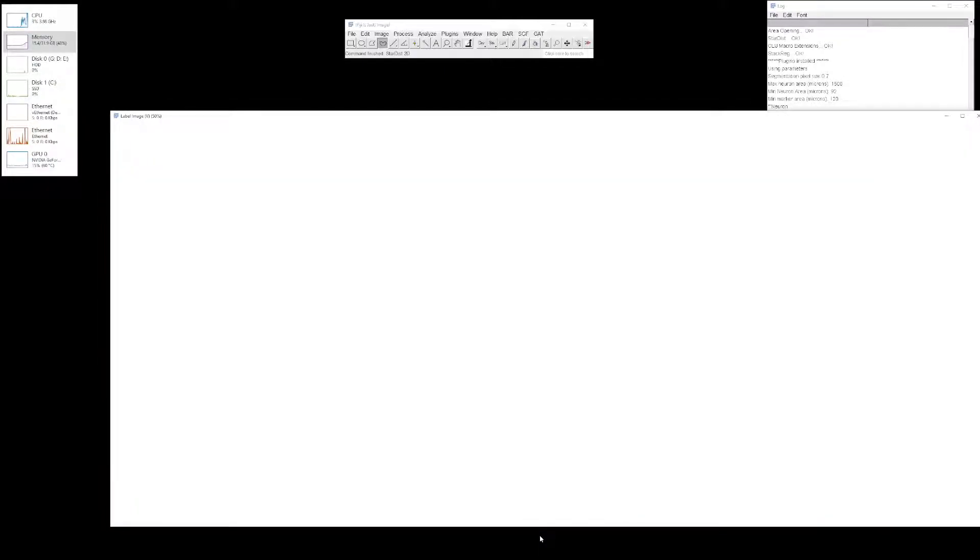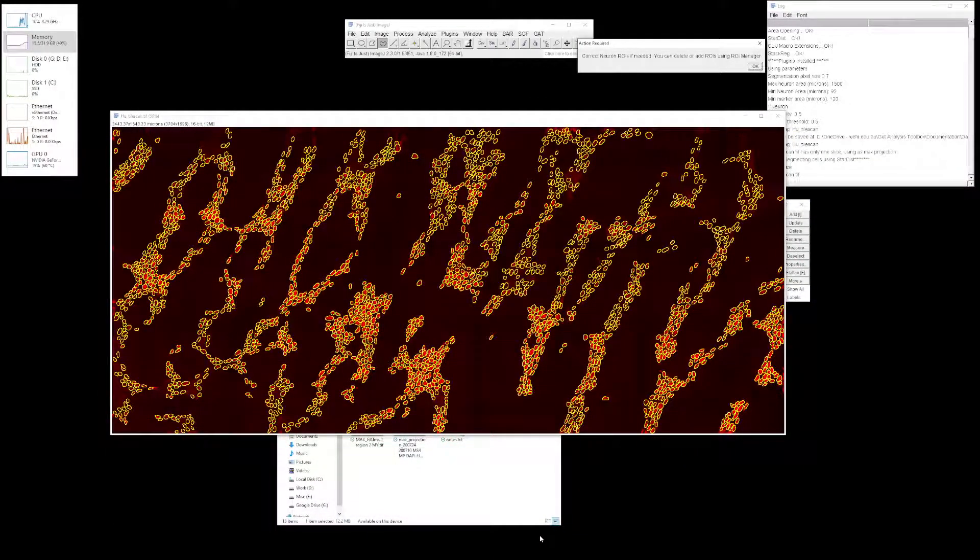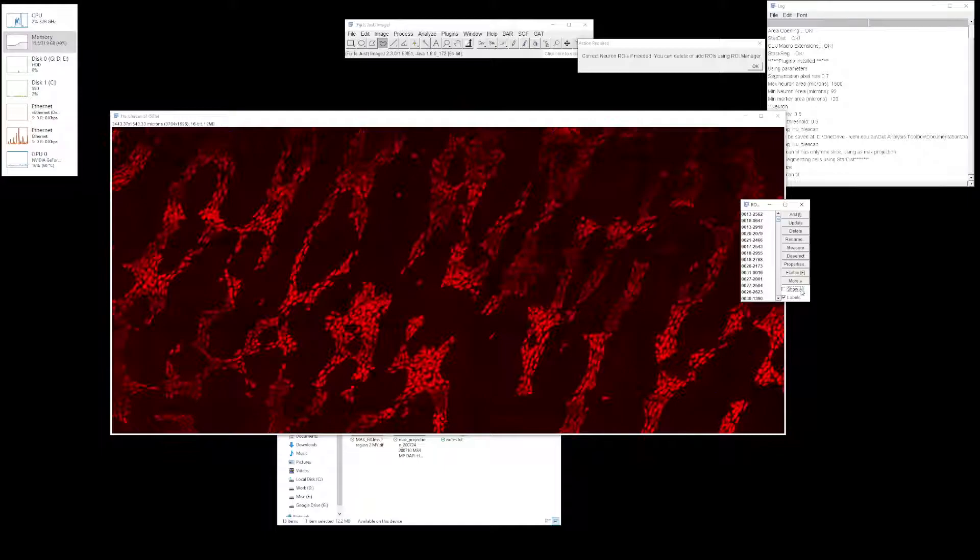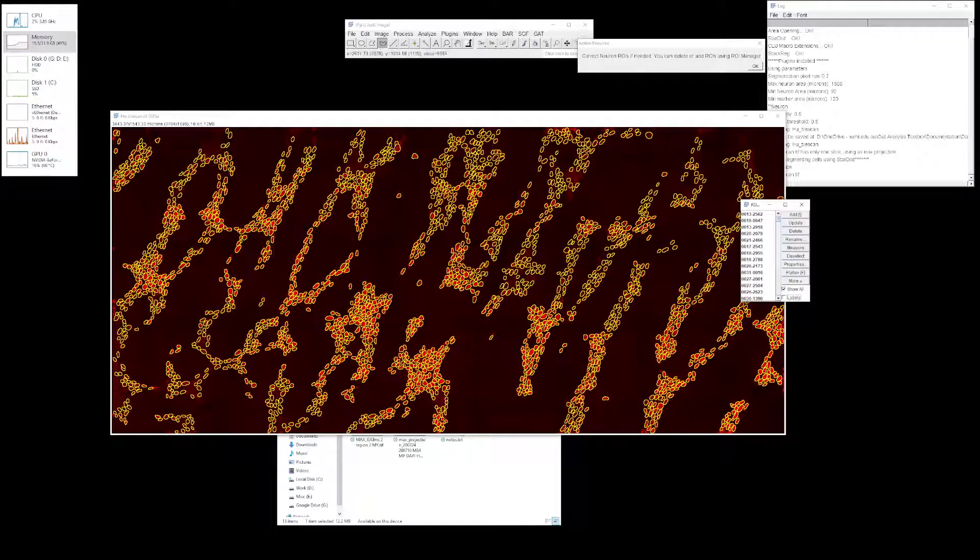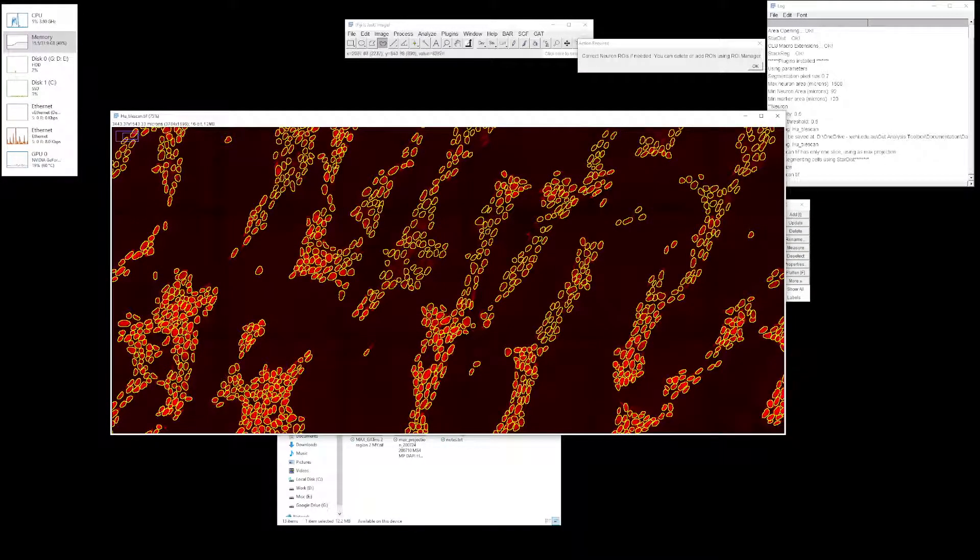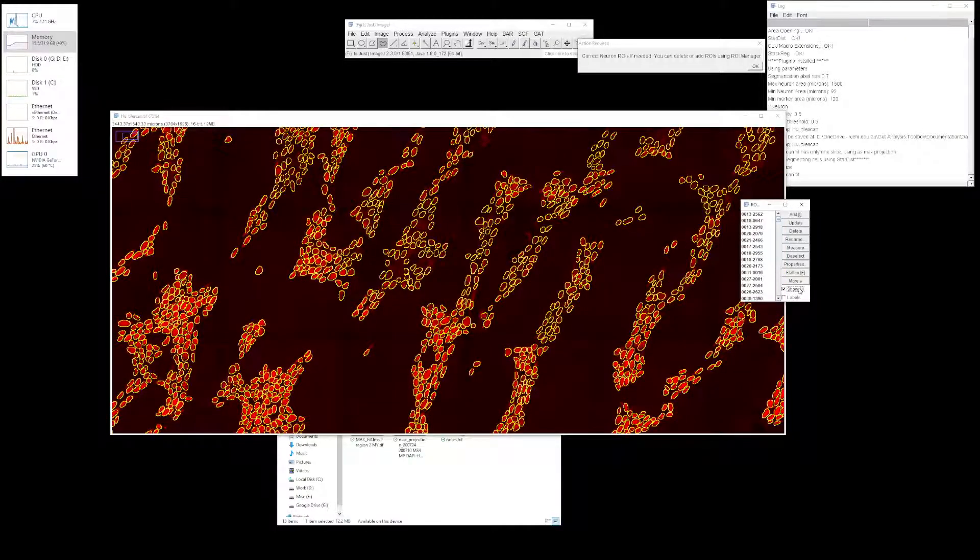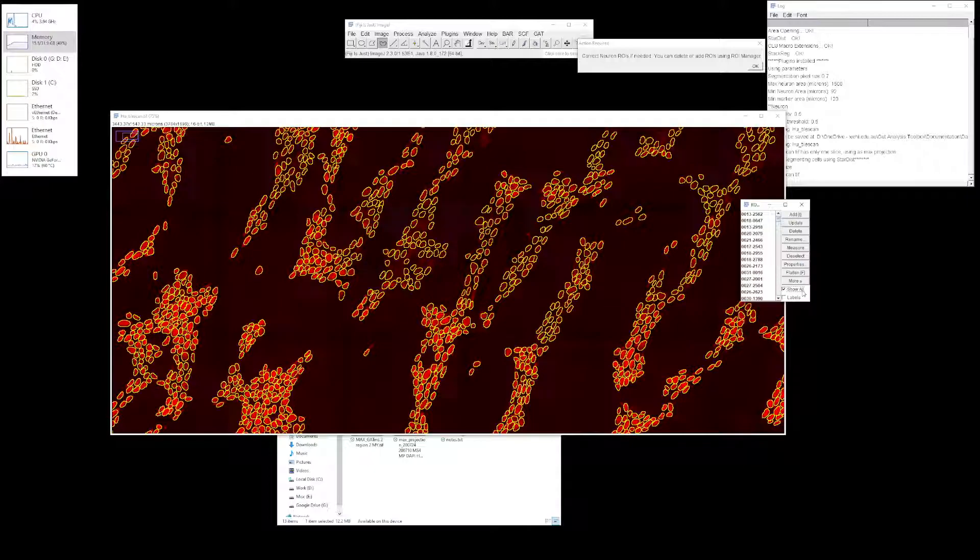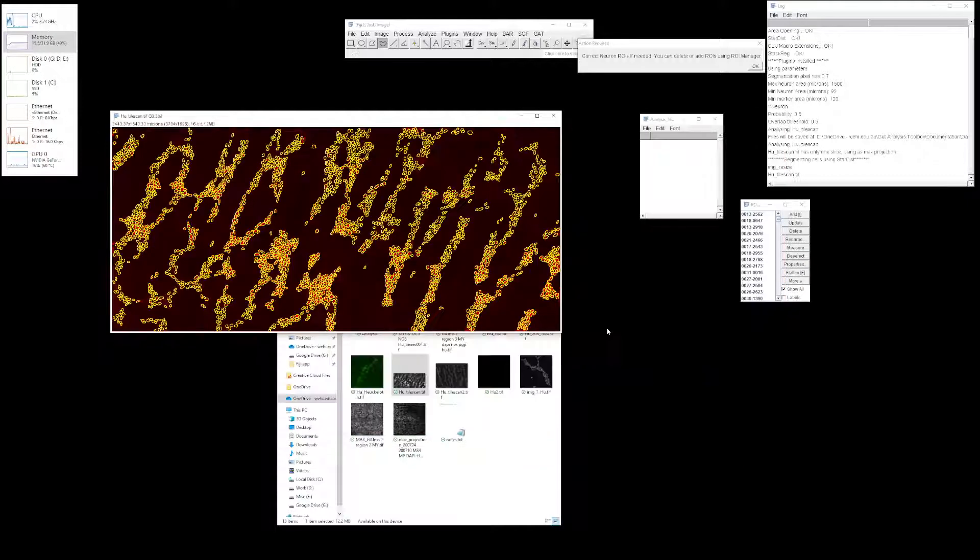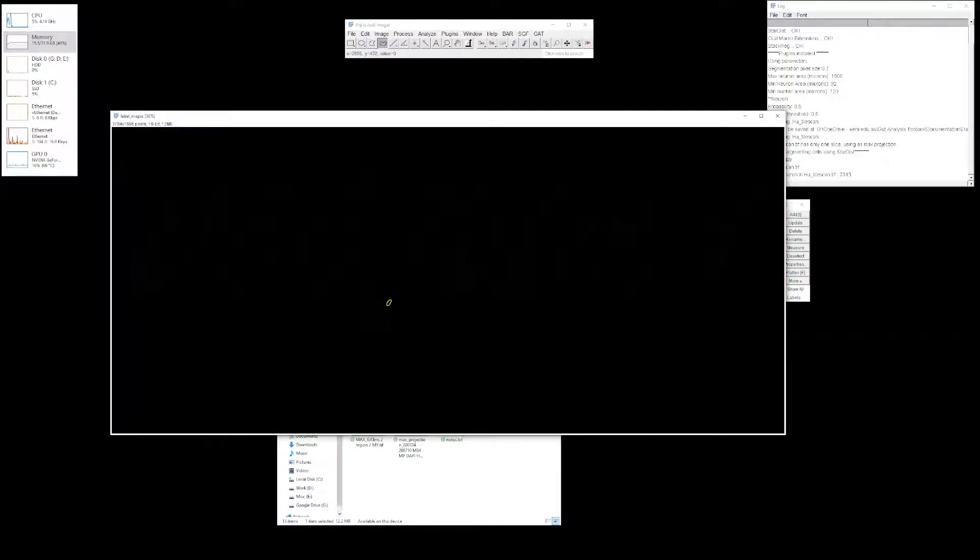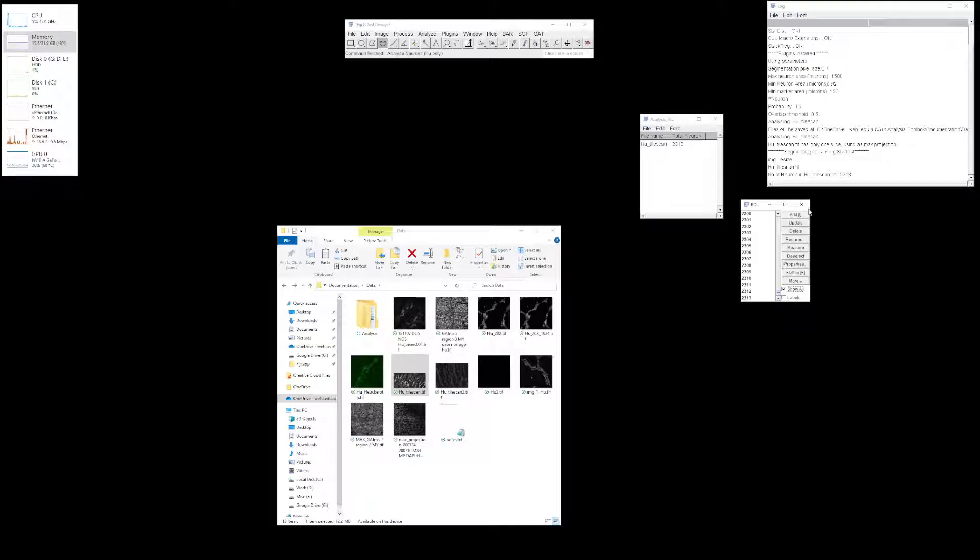Having a GPU, a graphics card, is a plus, but if you don't, that's fine. It'll still use your CPU or central processing unit to run this analysis. So that's done. You can see it's reasonably quick and done a pretty good job at getting quite a lot of cells. Of course, on occasion, if the staining is non-uniform, it still picks it up reasonably well. You can see it's not as uniform, but it still picks it up really well. But on the really light bits over here, it may have trouble picking up these cells. I can show you how to fine-tune this detection. For now, we've run this analysis. Click OK. Creates a label map and it's done. It's 2,313 neurons done in a matter of a few minutes.